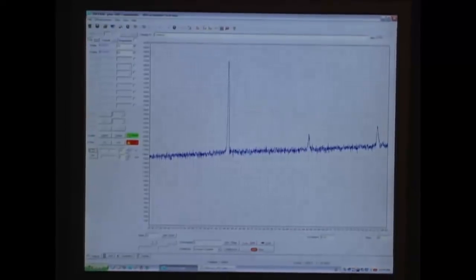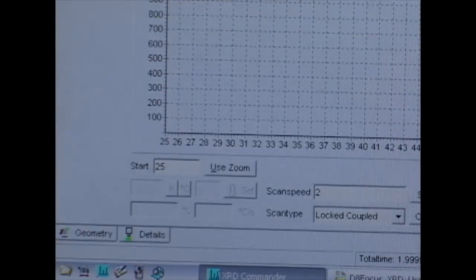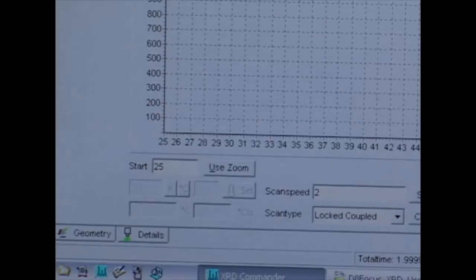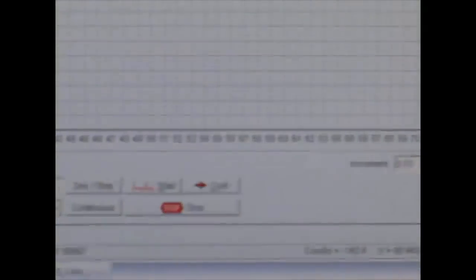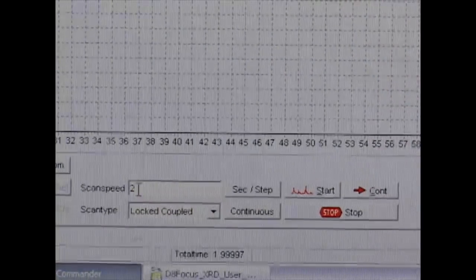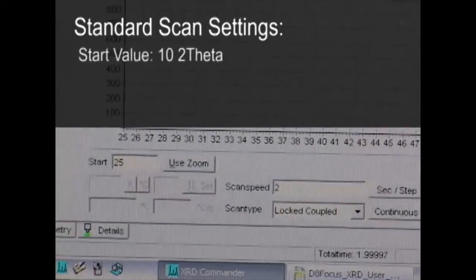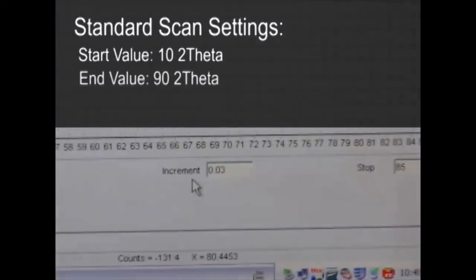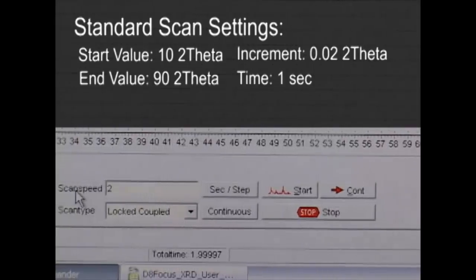We can run a scan in this window very easily. We just put in the start value and the x-axis here refers to the position of the detector and we call it 2 theta. The start button here, this is set already at 25 2 theta and the stop is at 85 2 theta. We have an increment here. This is in values of 2 theta and it's set right now at 0.03 2 theta. And then our scan speed, the setting here is 2 seconds per step. If you want to do a standard scan that's similar to what you see in most of the literature, you would have a start value of 10, an end of 90. Your increment will be 0.02 and your time will be 1 second. And that's a standard scan.